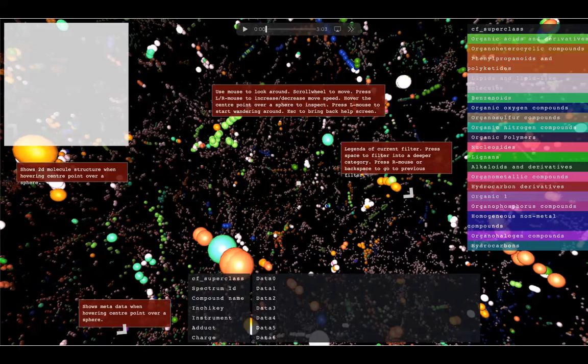Basically the students need to answer the question: can the computer learn chemistry from the mass spectra? Basically what I just asked you at the start, right? How can we assess that? Well, it's by mapping compound classes on the spectra. In this case, this is from a library, the GNPS library, so we know the molecules. We can map their classifier classes on top and color them accordingly.